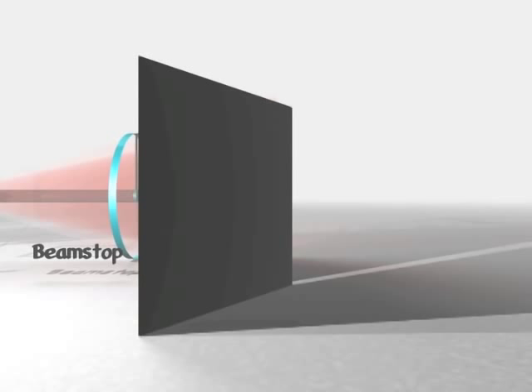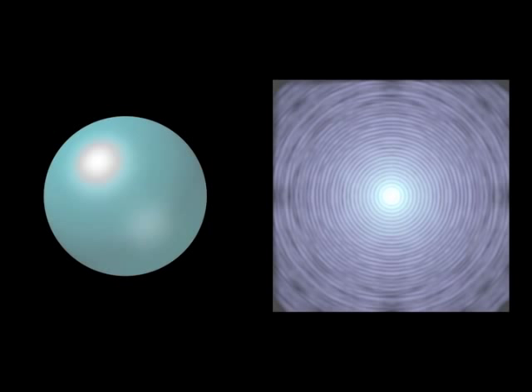So what will we see on the detector? What we see on the detector is the amplitude of the Fourier transform of the shape in the beam. So a sphere would show up as an oscillating function, as shown here on the right.